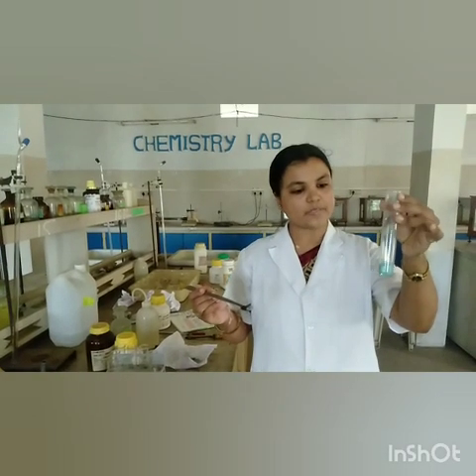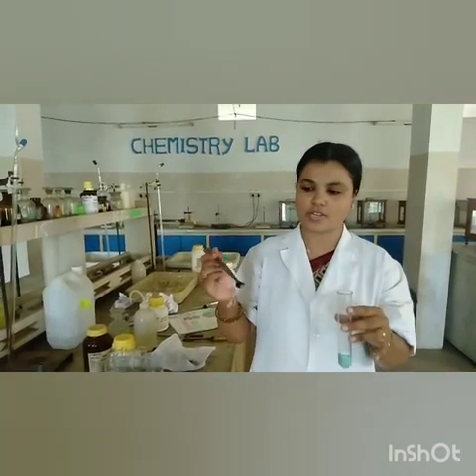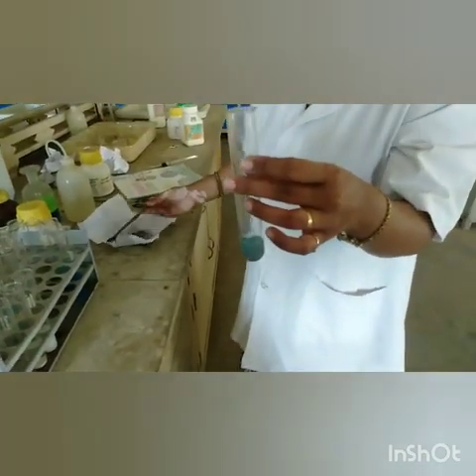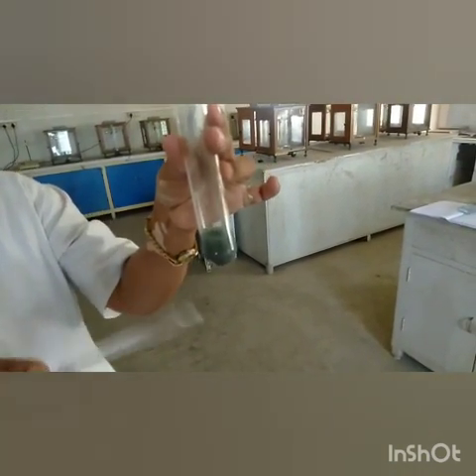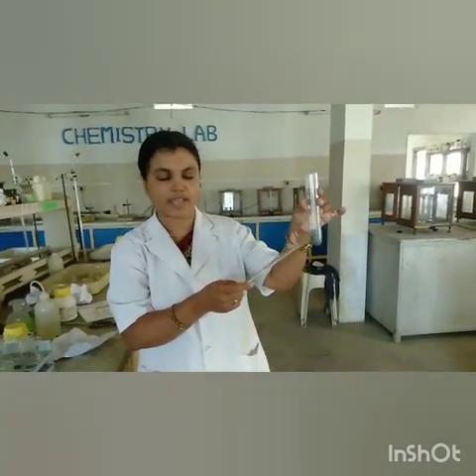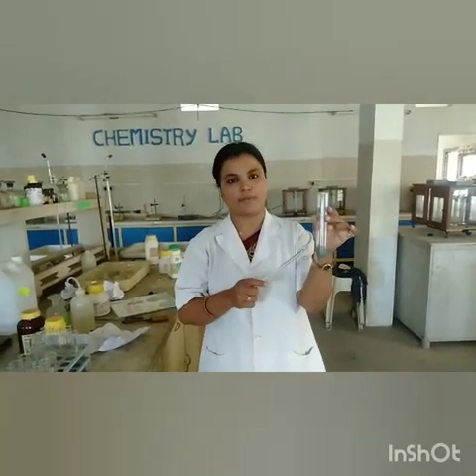Now let us see what happens to the blue copper sulfate solution. You can see this is the copper sulfate solution, and here is the aluminium powder, and I'm going to add it into this. Let us see what happens. You can see that the blue color of the copper sulfate disappeared, and the displaced copper got deposited on the aluminium here. You can see the blue color disappeared, right? So it shows that aluminium is more reactive than copper because it displaced copper.